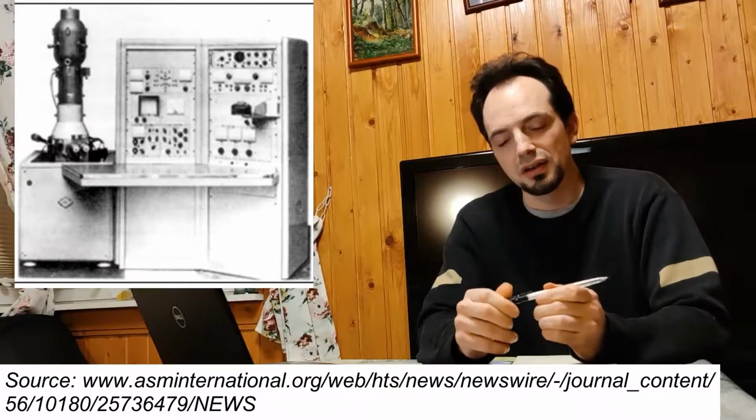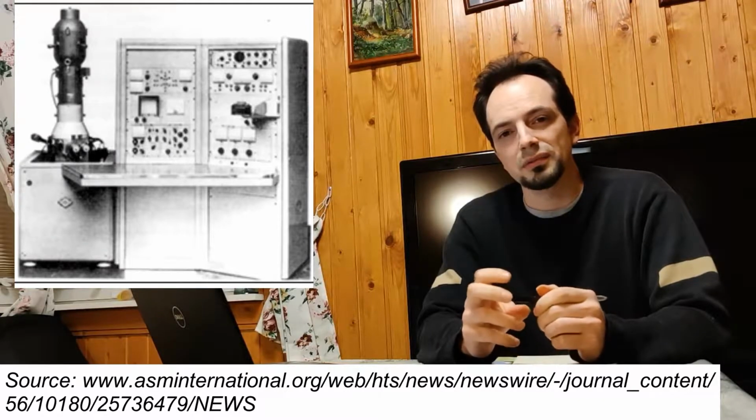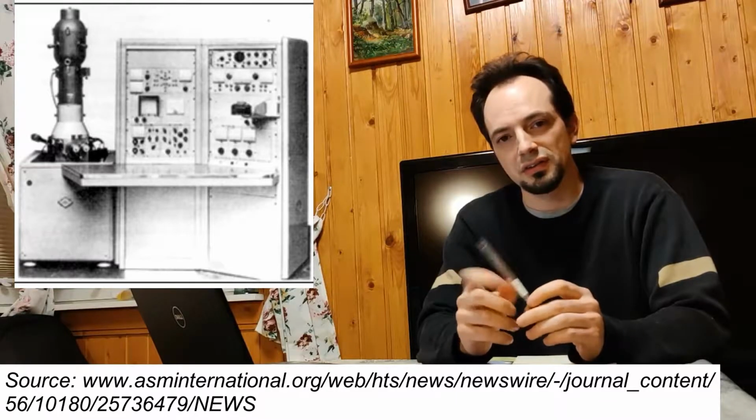So scanning electron microscopes were developed several years after the development of TEM, in the range of the 1930s to 1940s. And commercial SEMs were already sold in the 1960s. And since then they have been developed and upgraded, different add-ons have been added, and characteristics have been improved. So modern SEMs are quite advanced devices which give the opportunity of obtaining images of very high quality and very high resolution, in the order of nanometers or even less.